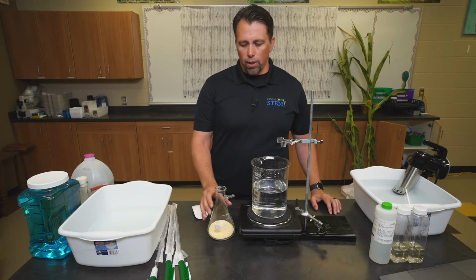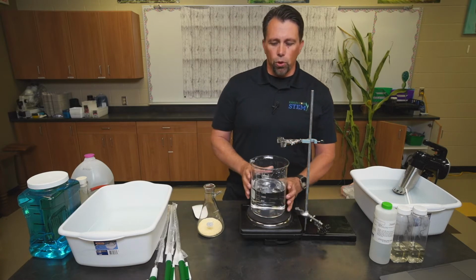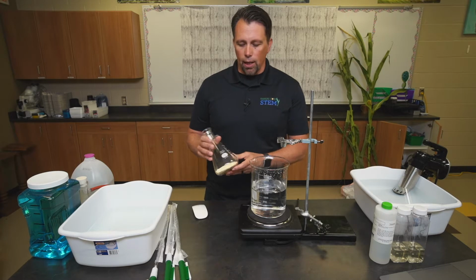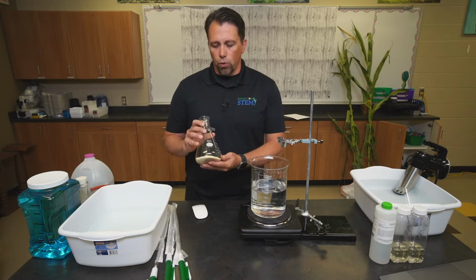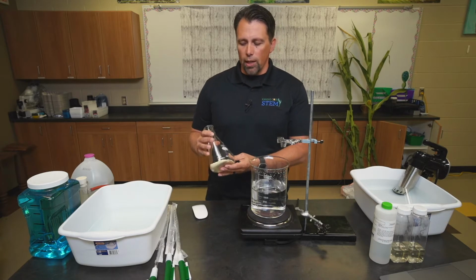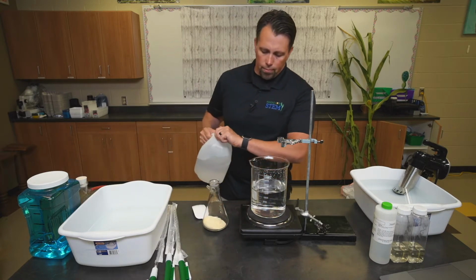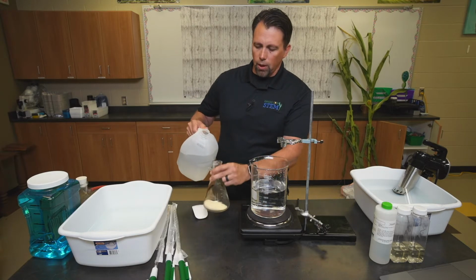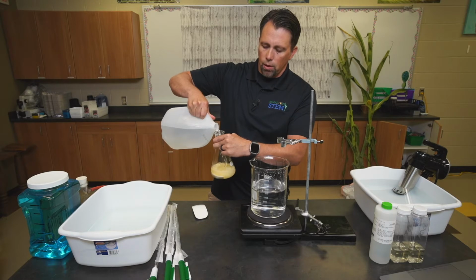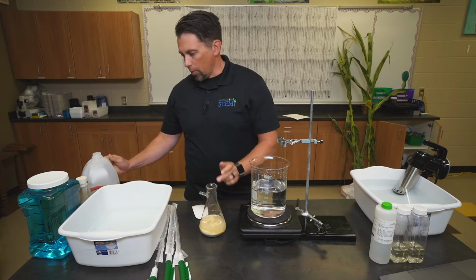And we will start with how to prepare the samples. So we'll set up a water bath. I use a 2-liter beaker, as long as the flask that you're using will fit inside of it. I have students mass out 50 grams of corn grind into their flask, and then add, it's not really particular, 150, 200 milliliters of distilled water to the corn grind, about 200 there.